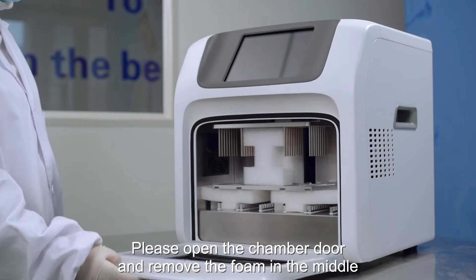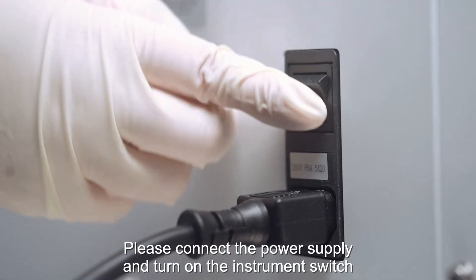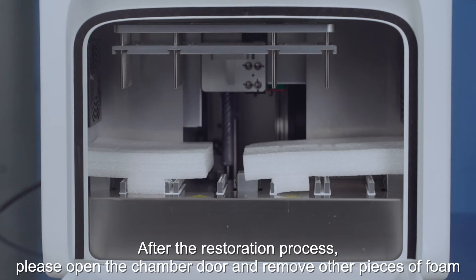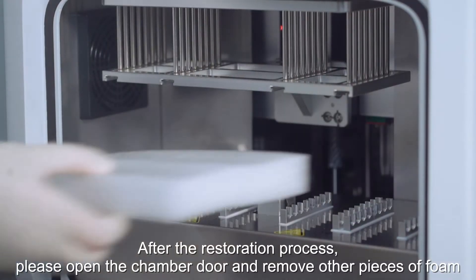Please open the chamber door and remove the foam in the middle. Connect the power supply and turn on the instrument switch. After the restoration process, please open the chamber door and remove other pieces of foam.